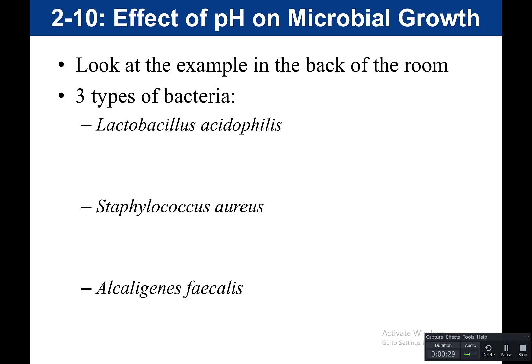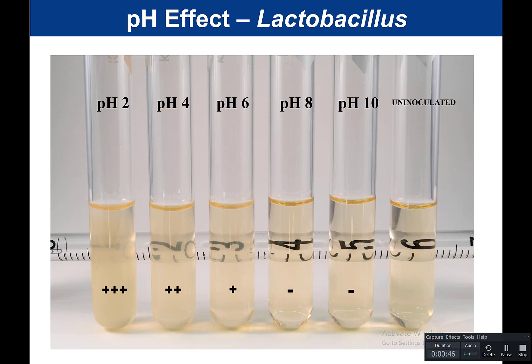There are three bacteria we're going to look at: Lactobacillus acidophilus, Staphylococcus aureus, and Alkaligenes faecalis. Let's look at our results for each of these organisms. The first one is Lactobacillus, and we have multiple tubes here.